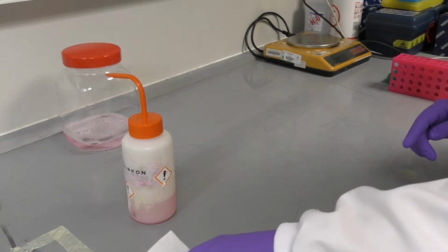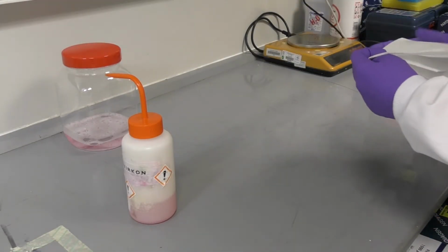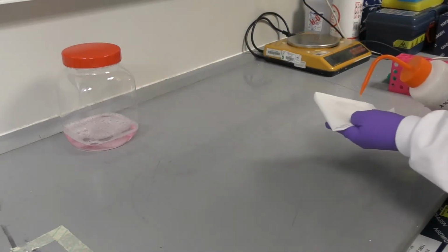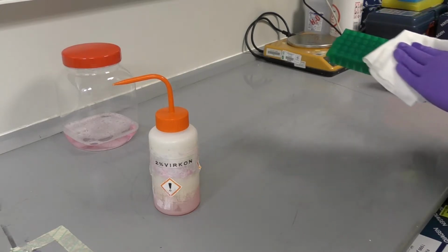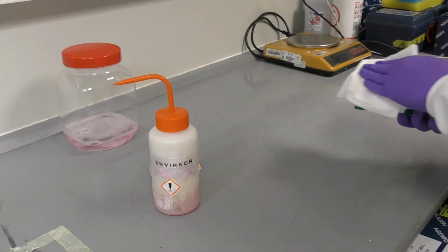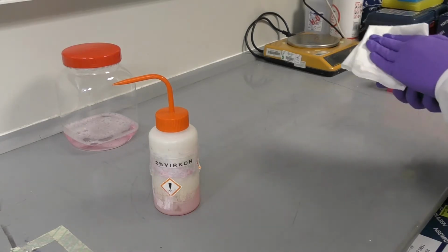Your workspace must be cleaned at the start and end of every day, as well as in between changes of procedure when you'll be working with different specimen types. The same process will also need to be undertaken if there are any spillages. For fluid spillages, you'll need to follow local guidelines, as there may be additional steps that you're required to undertake.